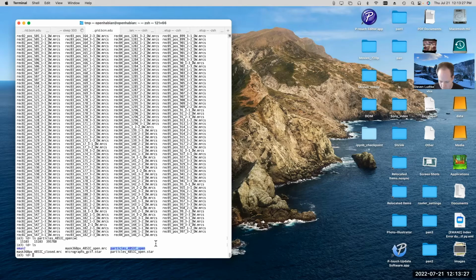All right. So you can see all of these files are in the MRCS format. The S on the MRCS, so there's no difference between an MRC file and an MRCS file. The S just denotes that the file is a stack file, meaning that it's not really a 3D volume. It's really just a bunch of particles which are stacked up along the z-axis. That's just a naming convention that the field has sort of adopted.